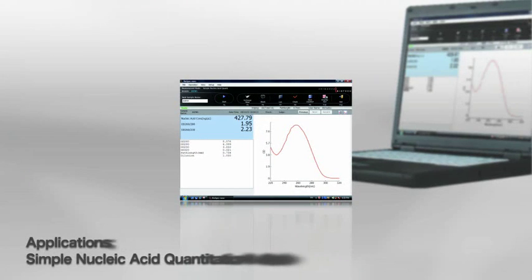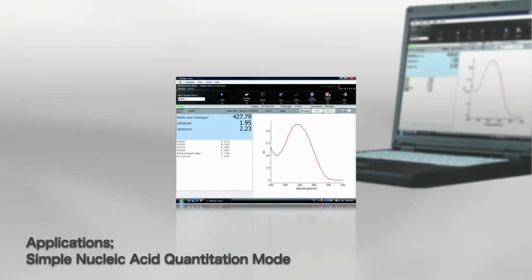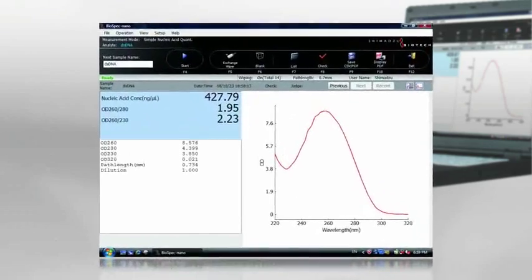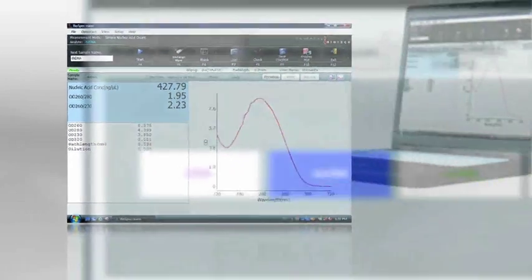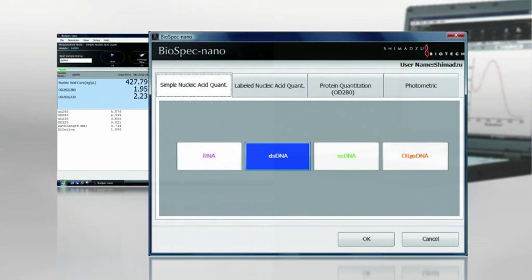In addition to the nucleic acid quantitation and labeled nucleic acid quantitation, BioSpec Nano has protein quantitation and optical density measurement for a specific wavelength. This versatile unit will function in a multitude of analytical methods.